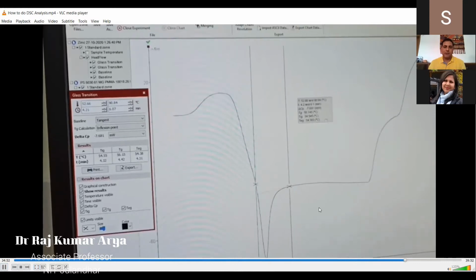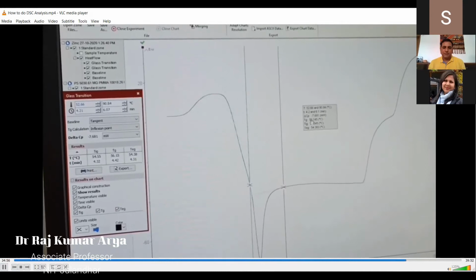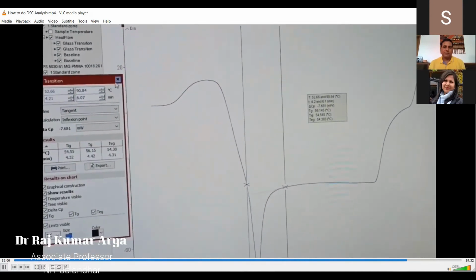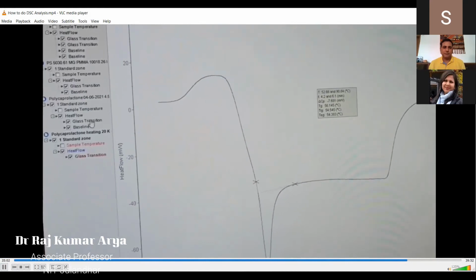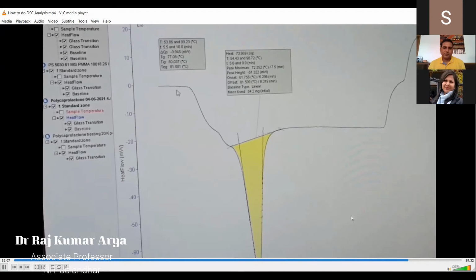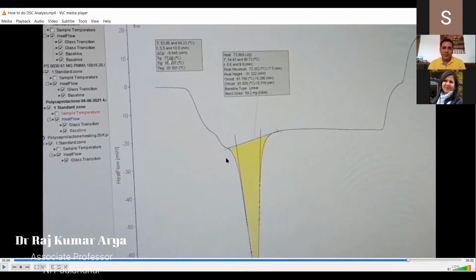You see there are no change in TG here. This is TG. Here is coming this 56.14, and for the previous one, for this sample here, this was the TG again. Now the TG, you see that its value is coming. So here in this sample, you can find the TG actually somewhere in this particular zone here.